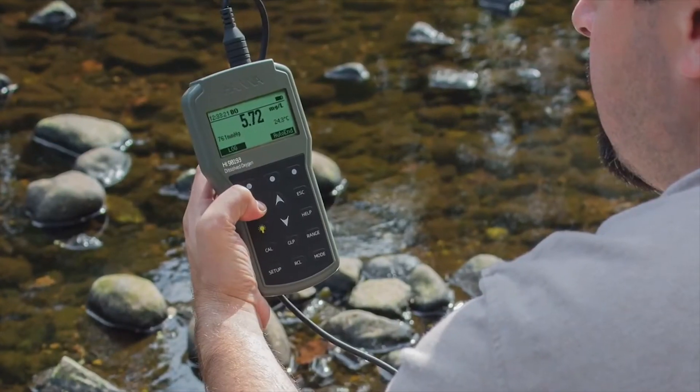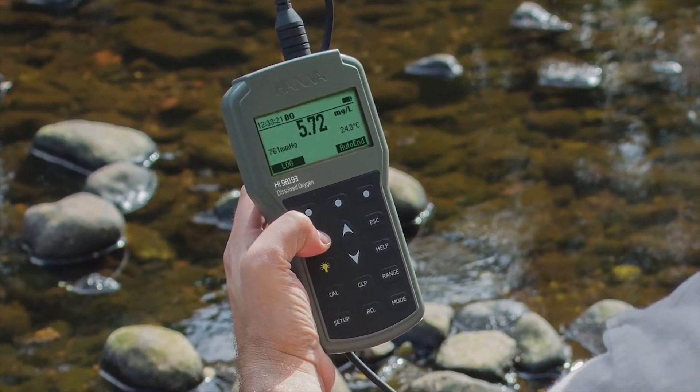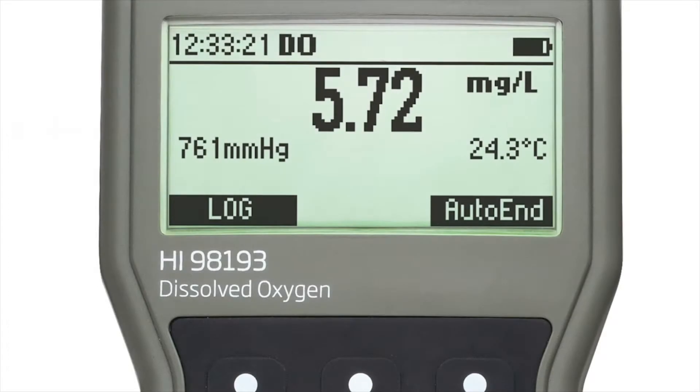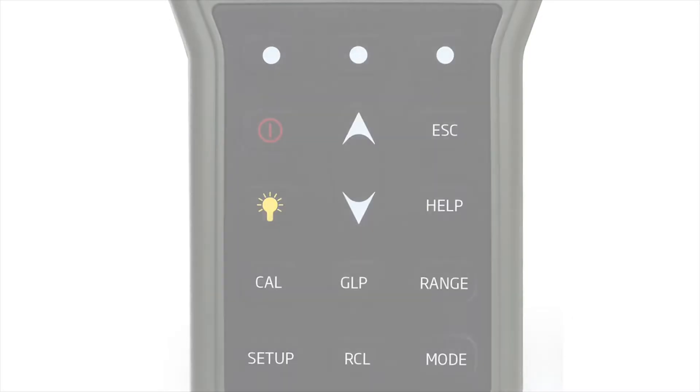This user-friendly ergonomic waterproof meter is built to withstand the harshest of environments while maintaining benchtop level performance. The meter features a large backlit dot matrix display and dedicated keys for calibration, setup, GLP data, and contextual help.